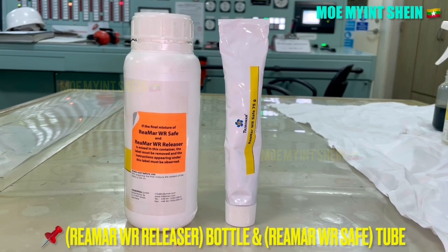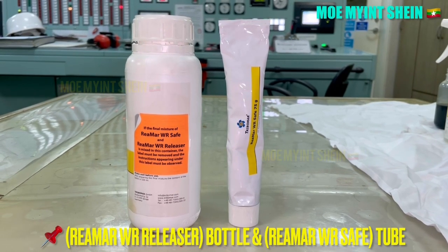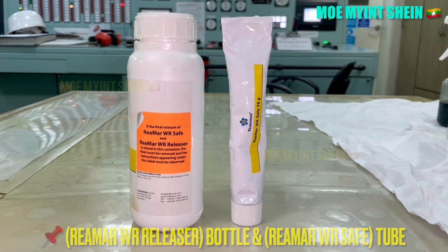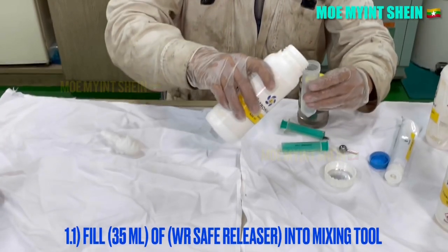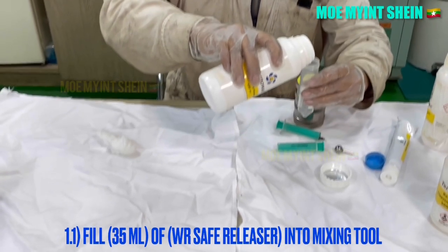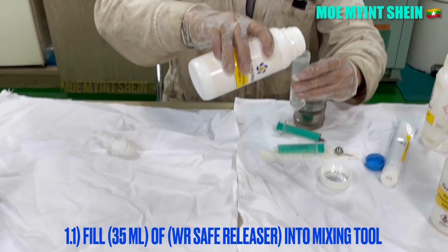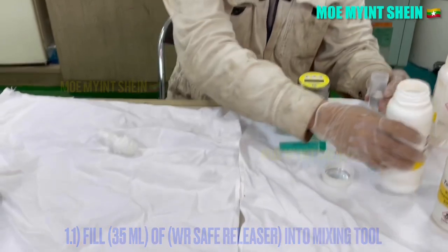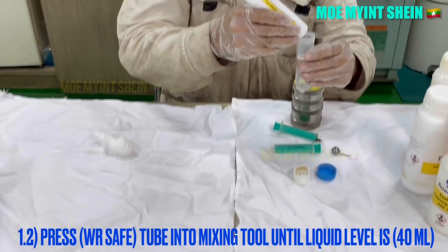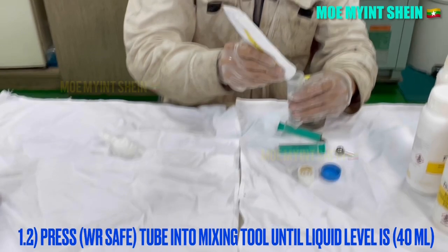These are the ReaMar WR releaser bottle and ReaMar WR safe tube. As first, fill 35 ml of WR safe releaser into the mixing tool, then press the WR safe tube into the mixing tool until the liquid level is 40 ml.